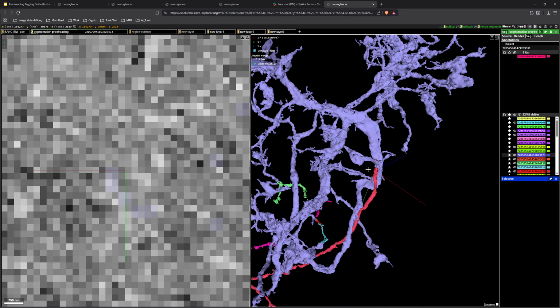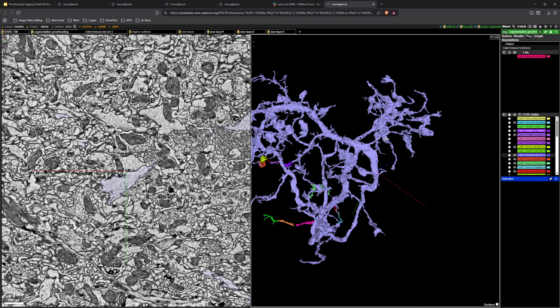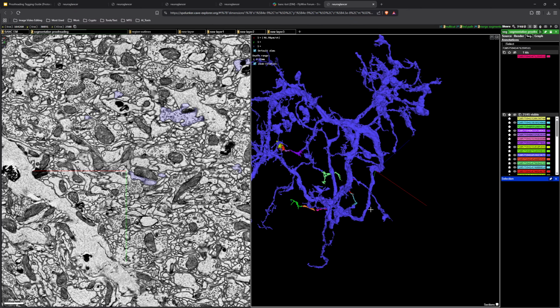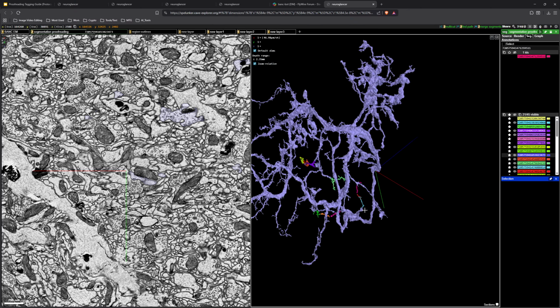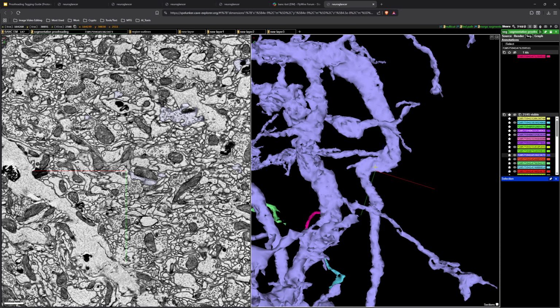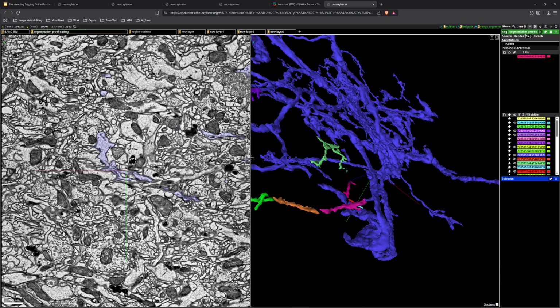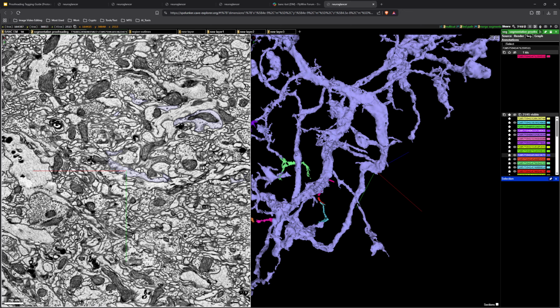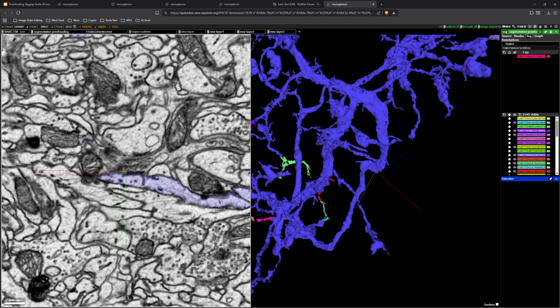So if this is very thick and the branches that come off of it are thinner, then we know that the branches that come off of that will also be thinner. But this is not a branch that's coming off of the cell. This is just the backbone continuing. So it gets thinner here, or less thick than here. So that's a good indication that somewhere from here to here is probably where the soma starts. And it might be out this way, but we know that they like to hug the sides here, and that is when we found the soma tract, which maybe it's this.